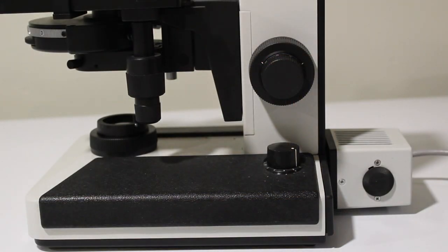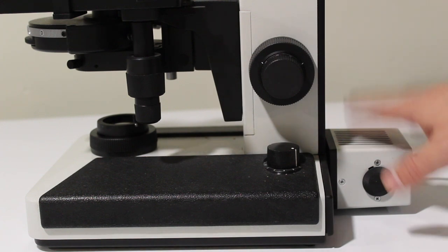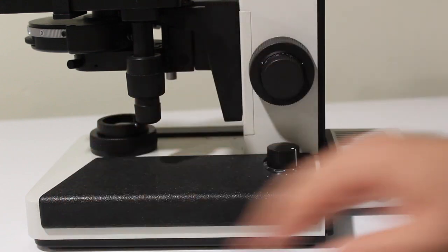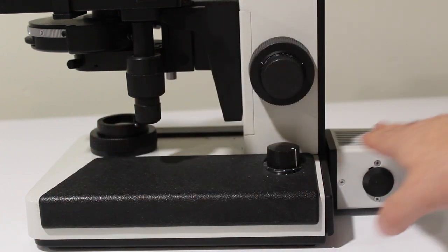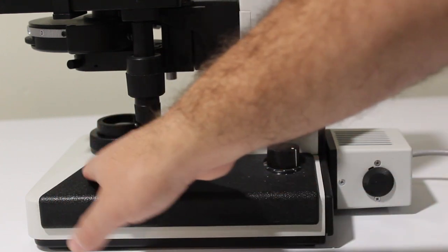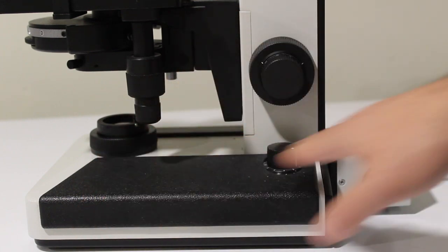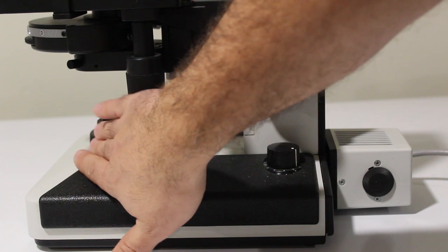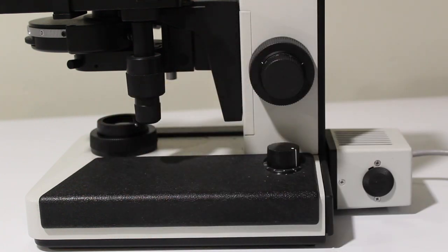Over the rest of the video, I'm going to take you on a tour of the microscope, tracing the light as it passes through the system. So my microscope has a bulb type light source, which is located here on the back. Most newer scopes use LEDs, and these are simply built into the front. So in my system, there's actually a series of lenses between the bulb and the illumination site, which will direct the light, whereas in an LED system, everything is built in right at the illumination source.